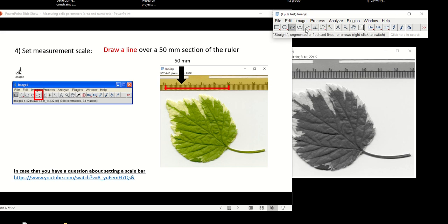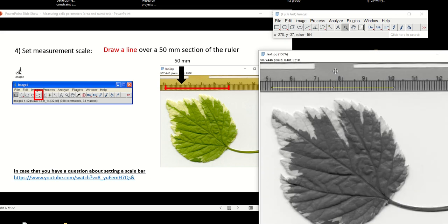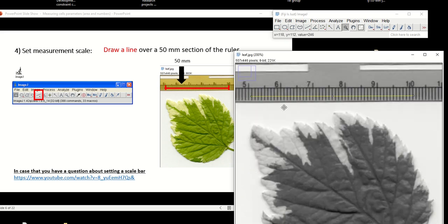We go for the line. Then we're going to measure. We can go here, left click, and go to 10. And if you want to be very careful that your measurements are right, you can zoom in. You can zoom, left click, and look. So I can put it in the long line, starting the long line and here.